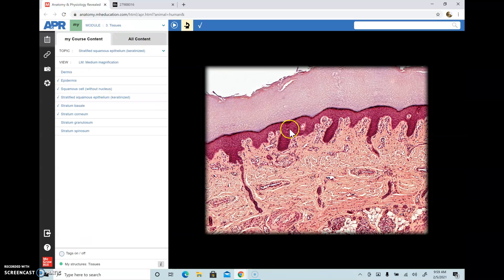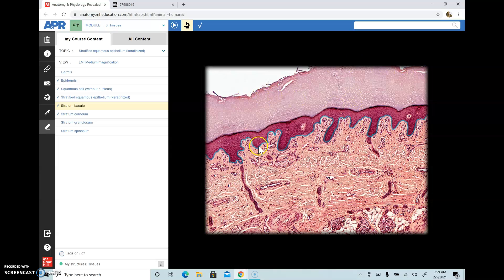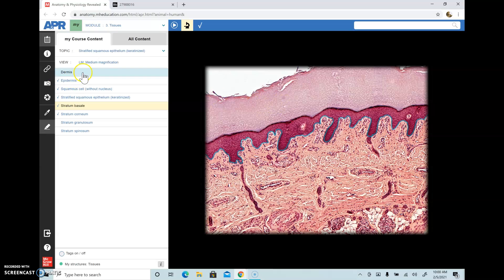This picture is probably from the foot because it has a very thick layer of stratum corneum. The stratum basale is the actively dividing basal layer. When we scuff off a layer of dead cells, we produce more cells that come to the top and die off to provide a thick layer of protection. So the live cells go up, die, and become the stratum corneum.